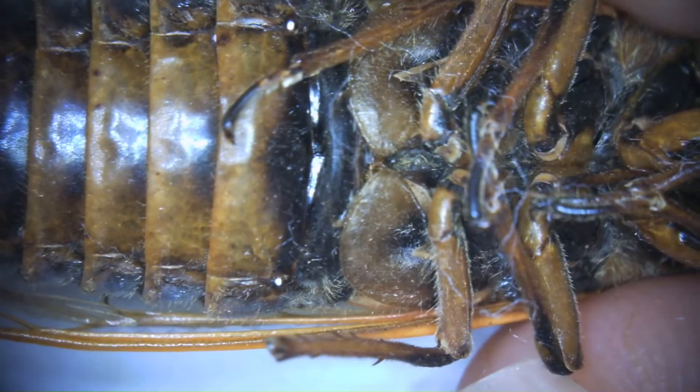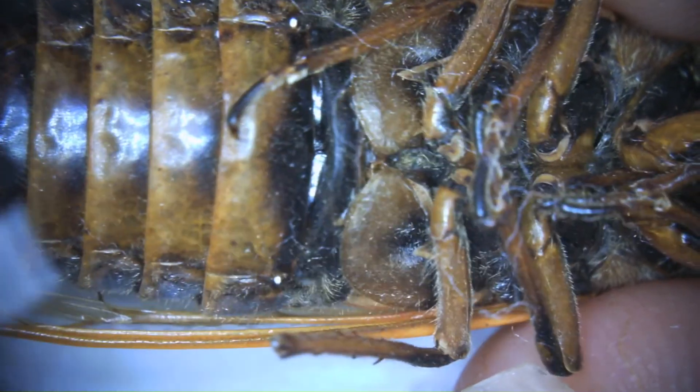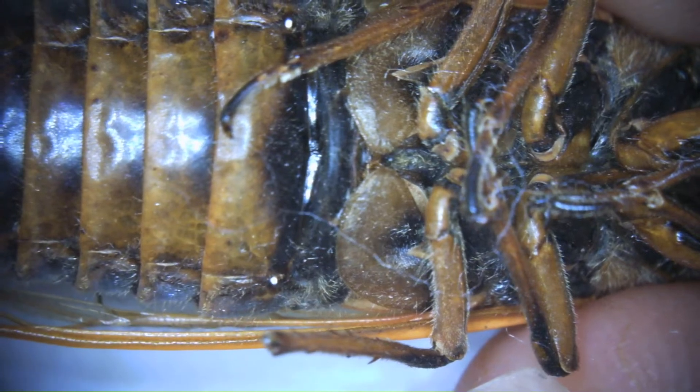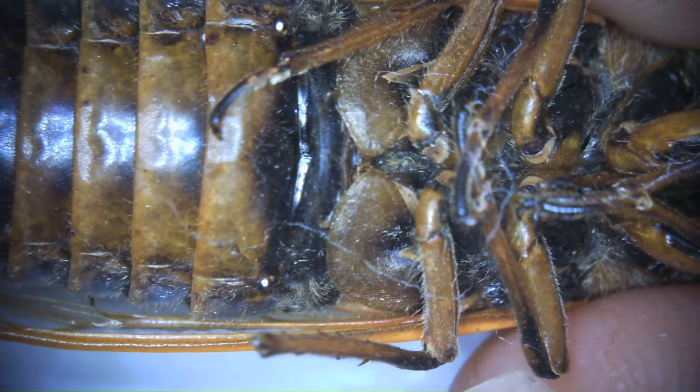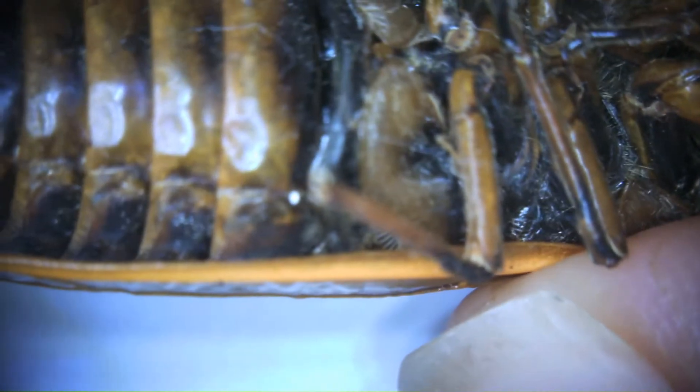Now we can see these weird circular plates that are underneath the legs, and those plates are what makes the cicada so famous — or infamous. Those are the tymbal plates, and that is what produces that noise that cicadas are really known for making. They have muscles on the inside of those plates that expand and contract and allow air to flow through, making that incredibly loud sound.